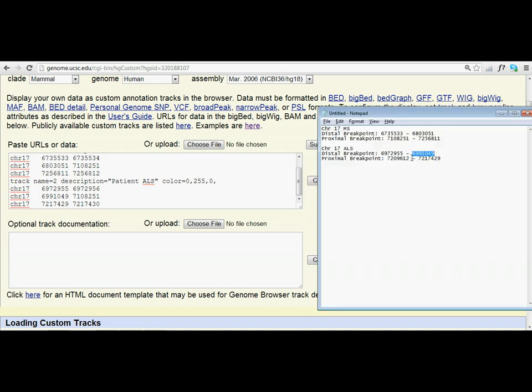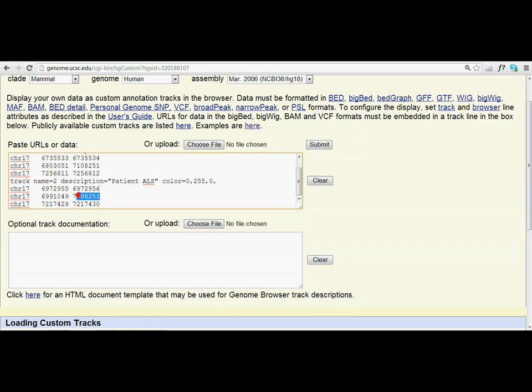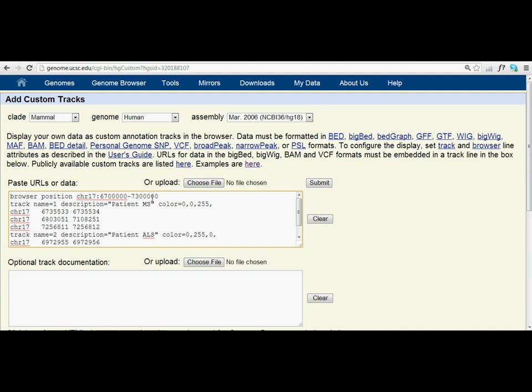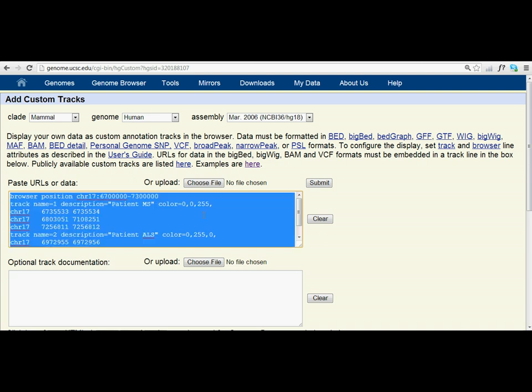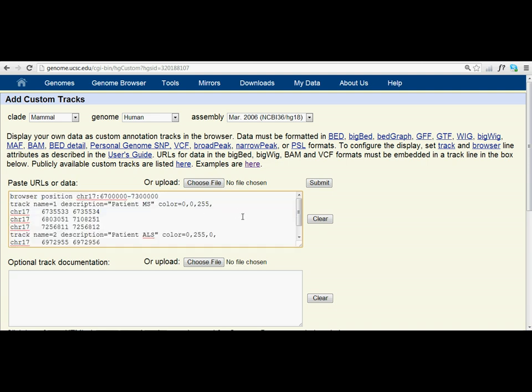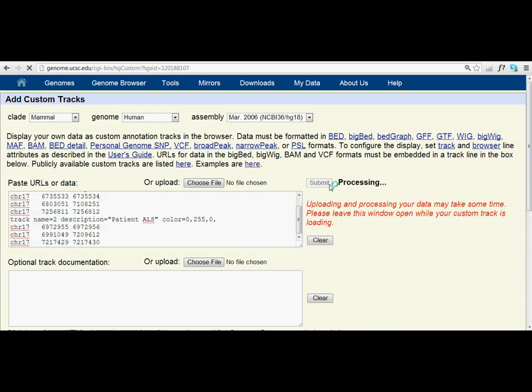Do you understand this? Yep. And then the rightmost one, here. So now we've got our two tracks registered. Now I press submit, and this should work.